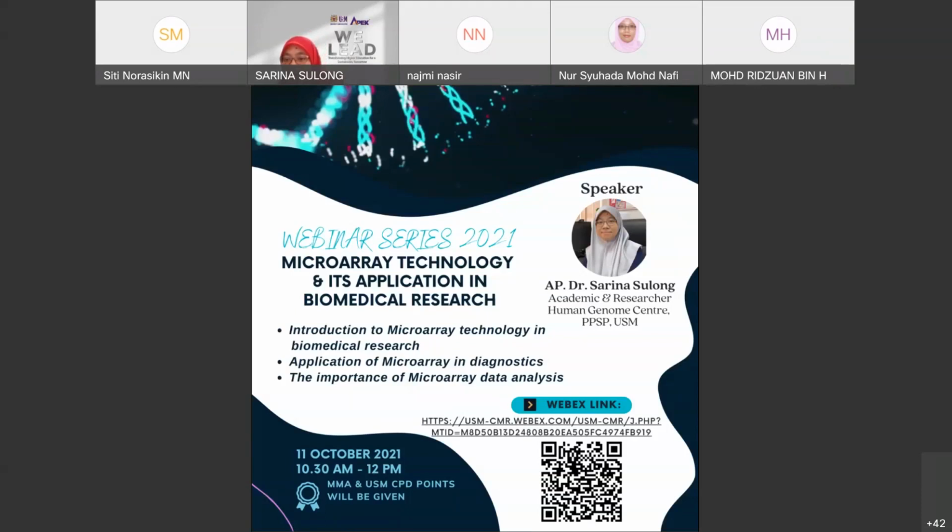Okay, next question. Can you advise us what is the best workflow if we want to identify novel biomarkers? I think you mentioned it already. Should we start with DNA microarray or NGS? In my opinion, I will go for microarray if you want to identify novel biomarkers, and it depends on the structure of your project and experiments, whether you want to use cell lines or human samples, whether you want to treat your cell lines with any natural products or drugs. Normally we use gene expression profiling for novel biomarkers, but the SNP array can also be used.